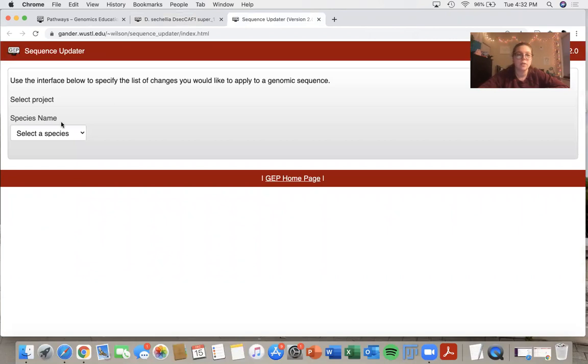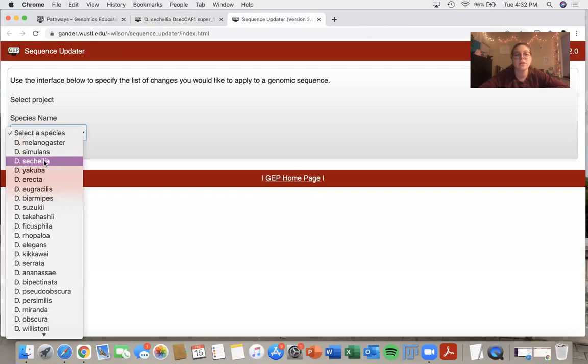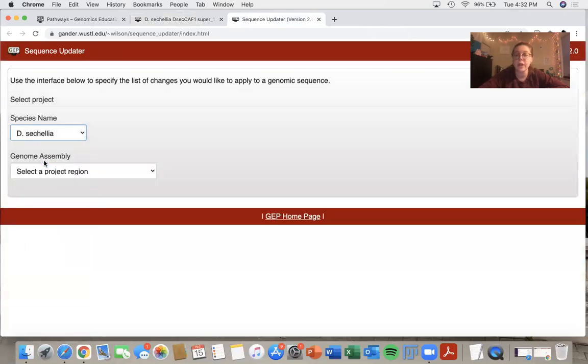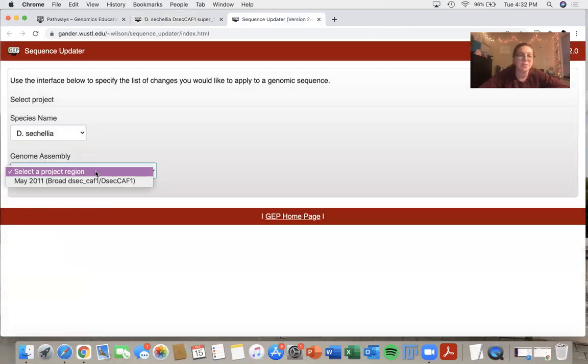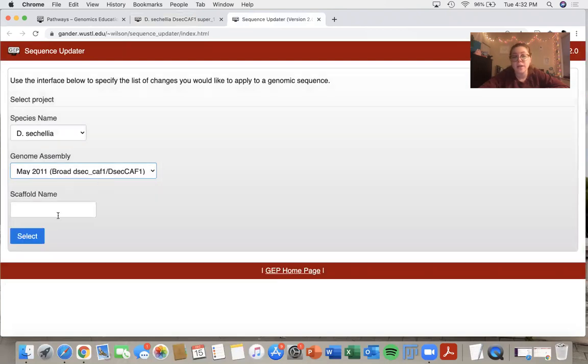So this is the first page. Select a species name. I'll click the drop down and choose Drosophila sechellia. The genome assembly, again, there's only one.